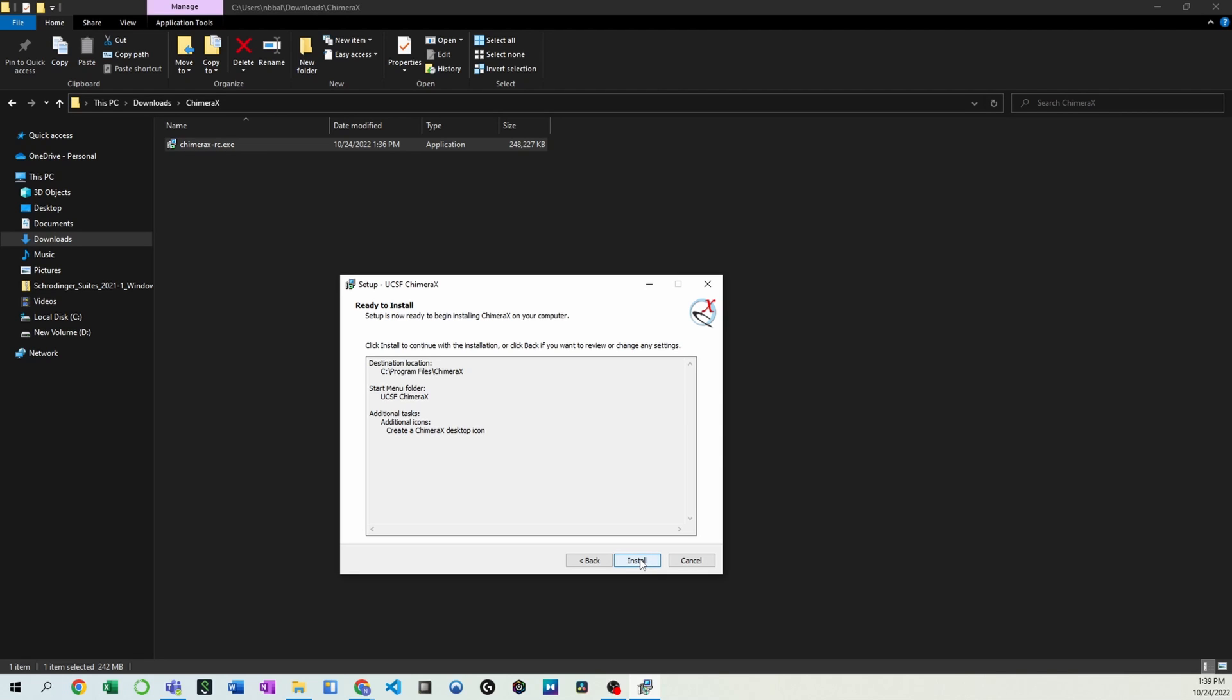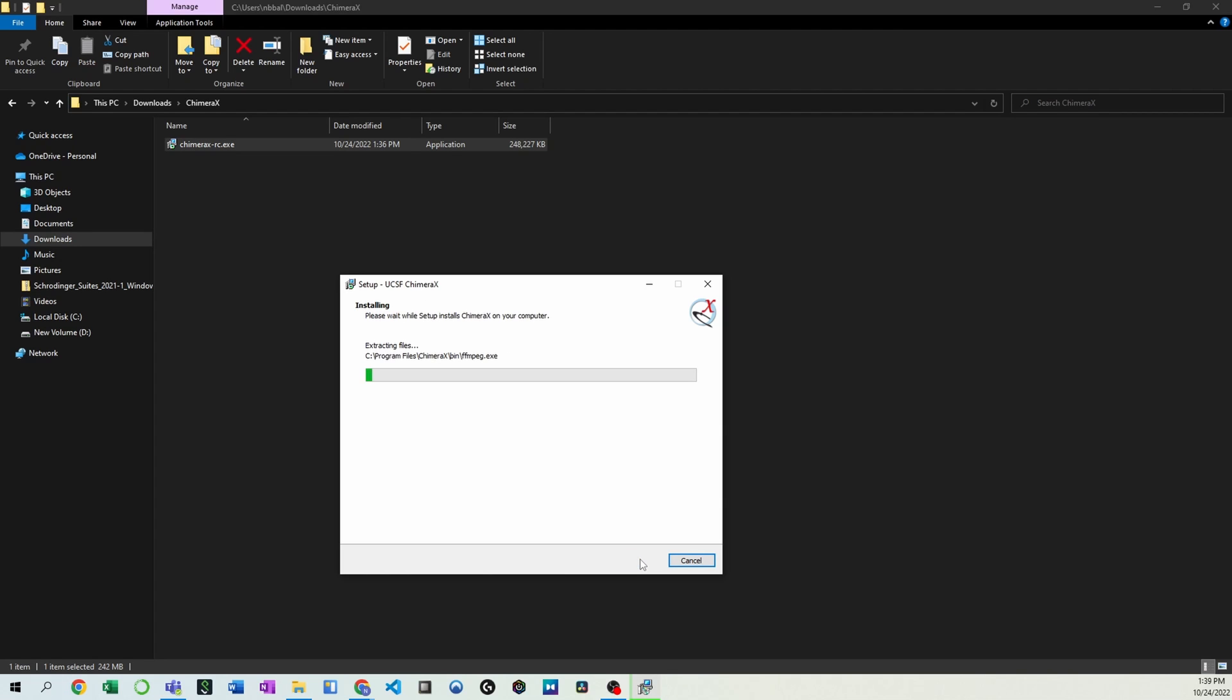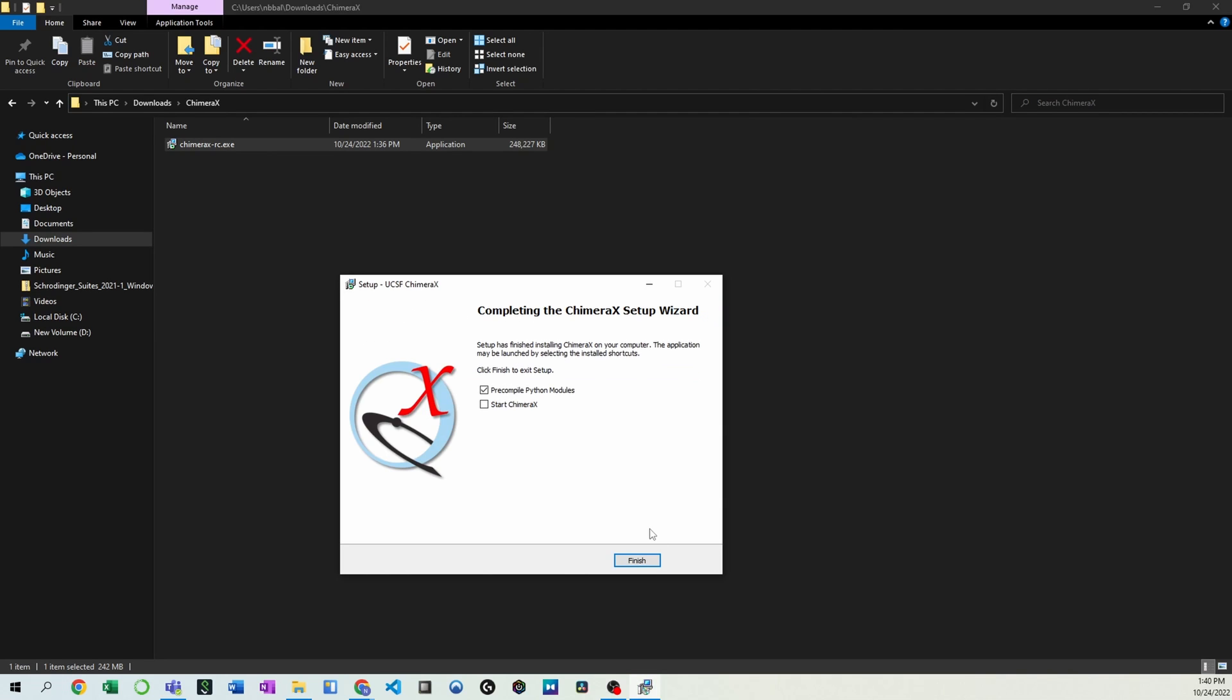Go ahead and install. Go ahead and finish, or if you're ready to open Chimera right now, we can go ahead and hit start.